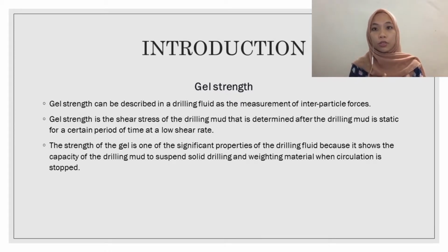motion. Next, gel strength. Gel strength can be described in a drilling fluid as the measurement of interparticle force. Gel strength is the shear stress of the drilling mud that is determined after the drilling mud is static for a certain period of time at a low shear rate. The gel strength is one of the significant properties of the drilling fluid because it shows the capacity of the drilling mud to suspend solid drilling and weighting material where circulation is stopped.